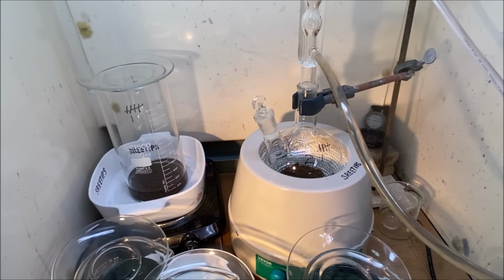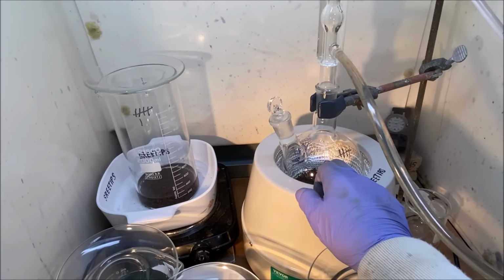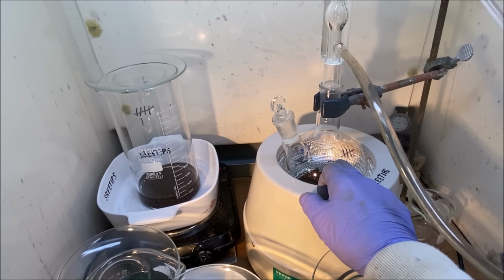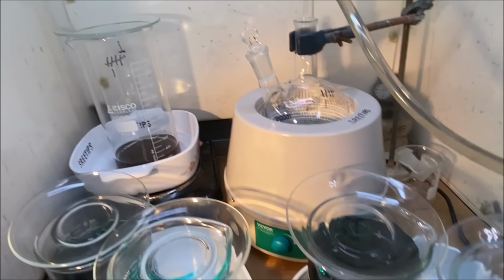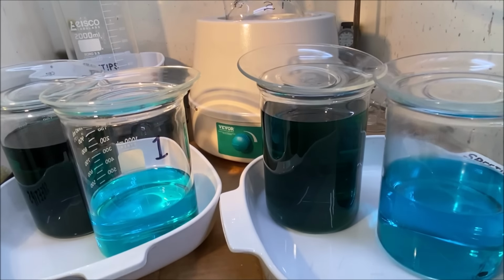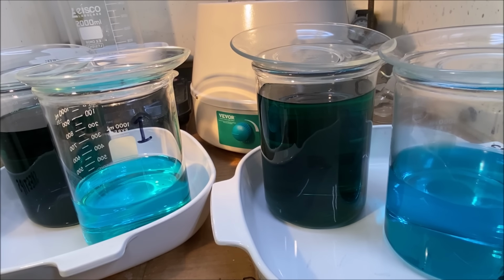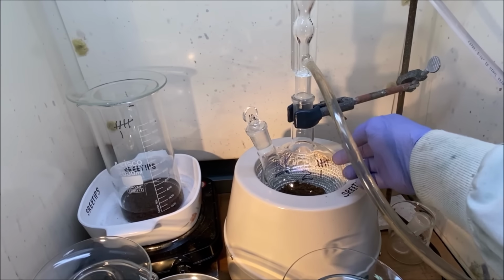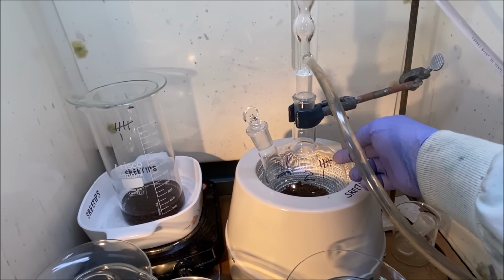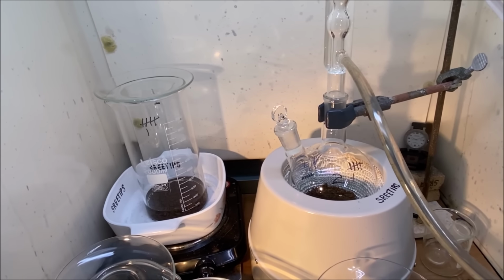I've allowed everything to cool completely, and the goal of this experiment was to see if the reflux used less nitric than the open beaker did, and I cannot honestly say that I've seen a difference in the amount of acid that I used. They both seem to have used the same exact amount, and the only difference I noticed was that it was a lot more cumbersome getting the liquids drained out of this reflux setup than it was out of our open beaker.